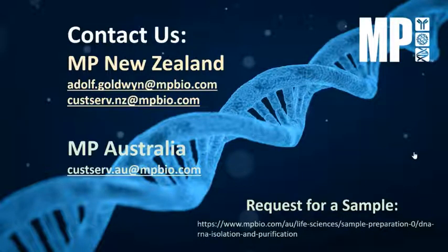Thank you. Okay, the next question is about low yield and diluted samples. If samples are diluted and giving low yield, what recommendations do you have to increase the yield?